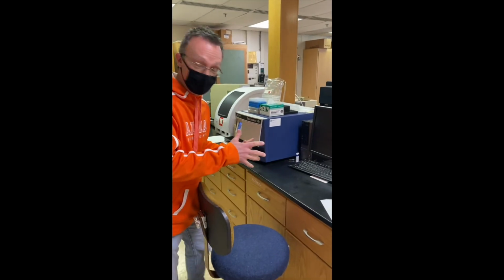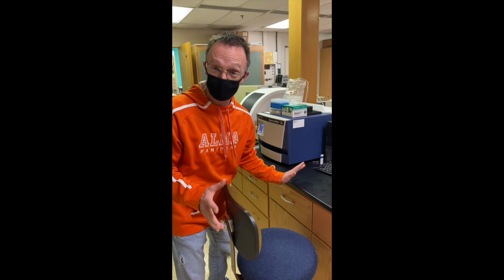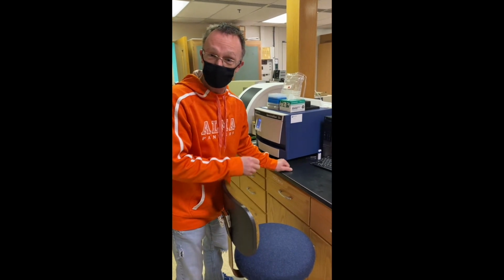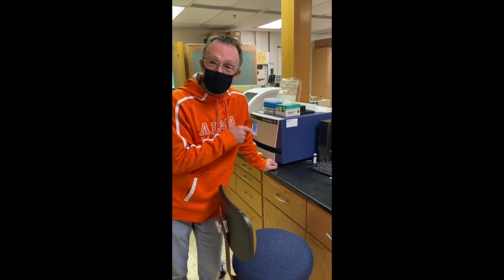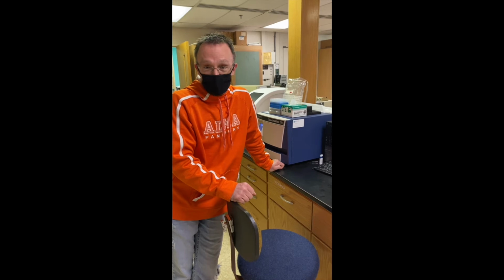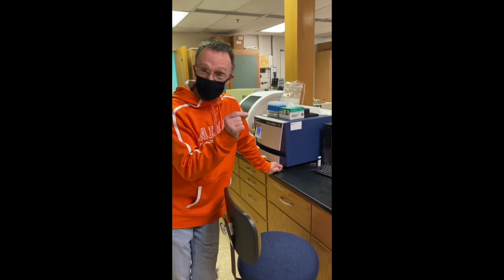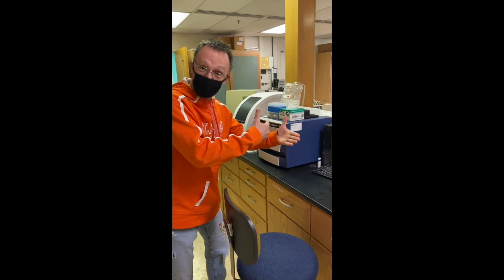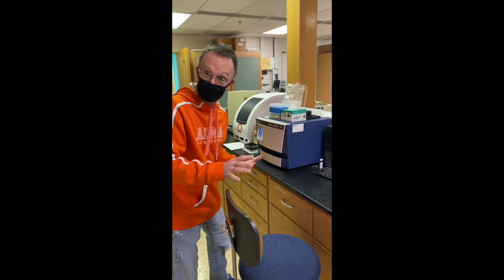This device here is called the Spectramax I3x, which probably doesn't mean anything to you, but it's a plate reader that measures the fluorescence of molecules. And the way that I use this in my research is I measure the inhibition of influenza virus. It's human influenza virus. We make little tiny molecules with fluorescent tags on them, and as they interact with the virus, we see changes in fluorescence, and this thing can measure it. It's awesome. Let me show you where we keep our virus.